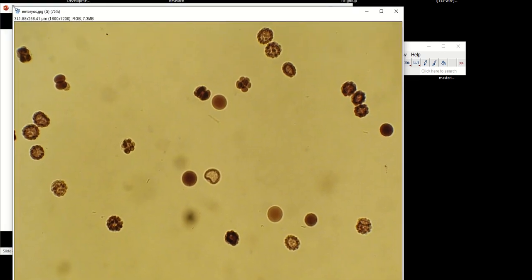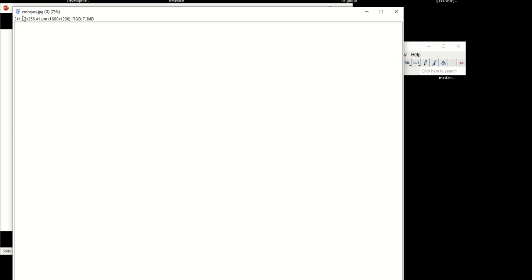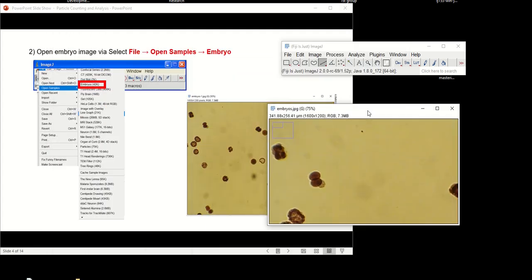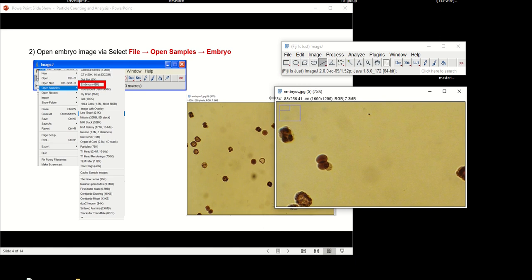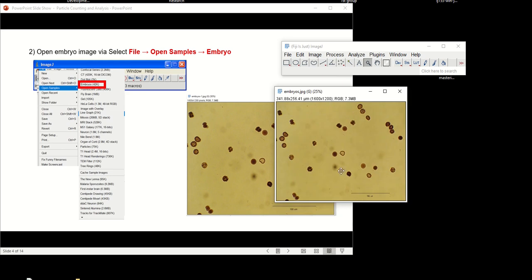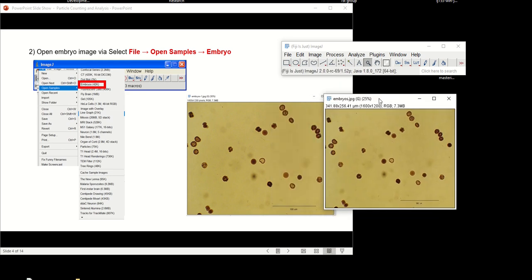I'm going to just make it smaller by clicking here on the left, something that I'm sure you already know how to do. In case you want to see the entire image, I remind you that you can zoom in and zoom out, and there are different tutorials to do that. In my case, I just go here, Control right click, and here I can see the entire image.